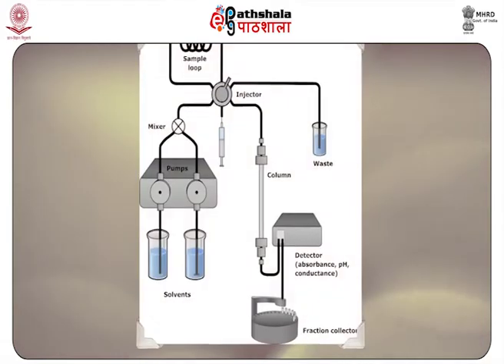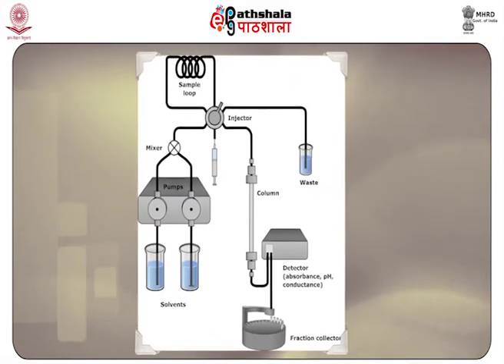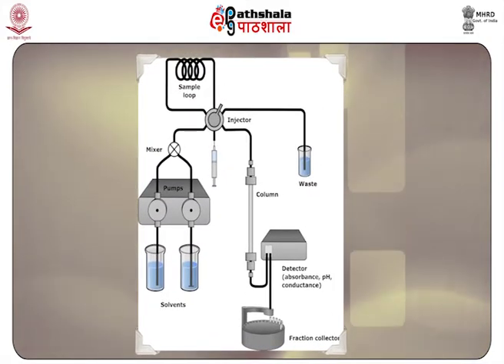The main component of this instrument is the pump that helps in passing a pressurized mobile phase containing the sample mixture through the column filled with a stationary phase. Each component of the sample reacts differently towards the stationary phase, causing the different components to flow out at different rates, which leads to the separation of the components of that sample.